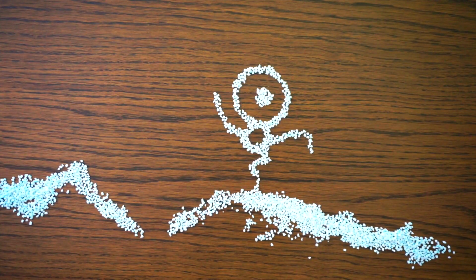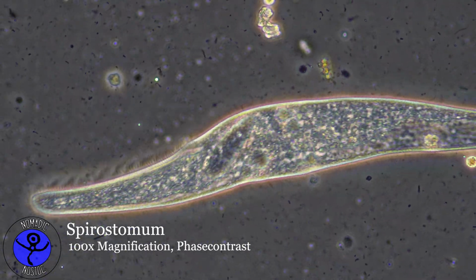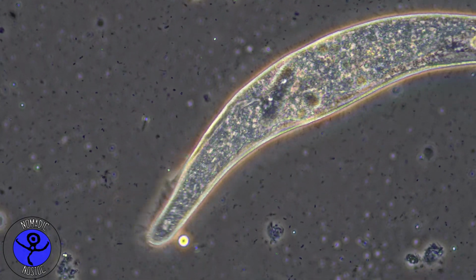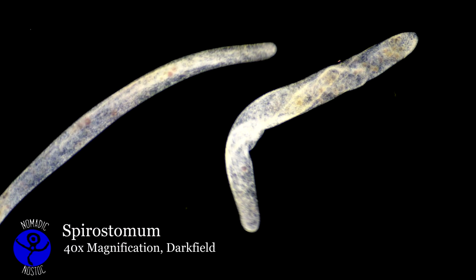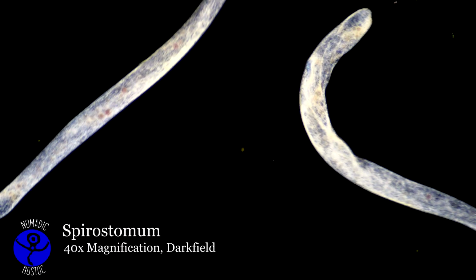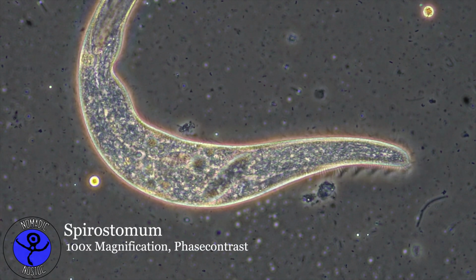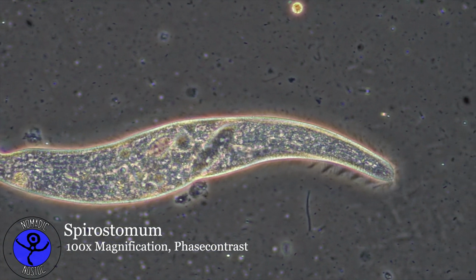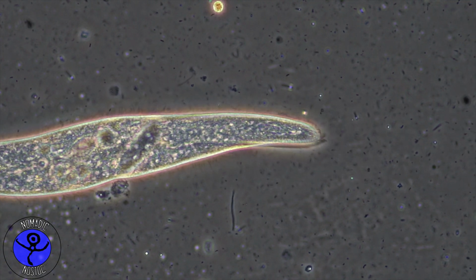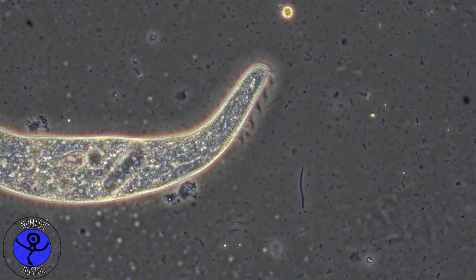This sausage-shaped fellow here is called Spirostomum, and is also a fairly common microbe. This microbe, in fact, is so huge, for microbe standards, that it can be seen with the naked eye. In fact, if you go, for example, to a pond that is being shaded by trees or bushes, you can see in the water between the algae sometimes something like small little white worms that almost don't seem to move much. This is Spirostomum. You definitely should check that with your microscope if you have one.